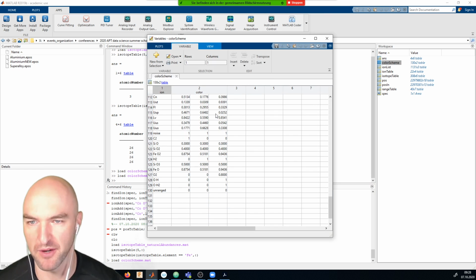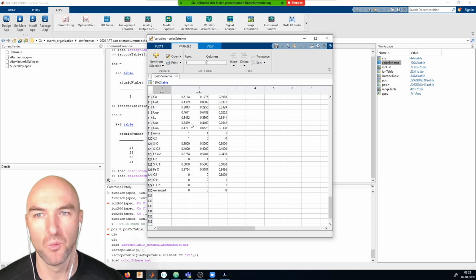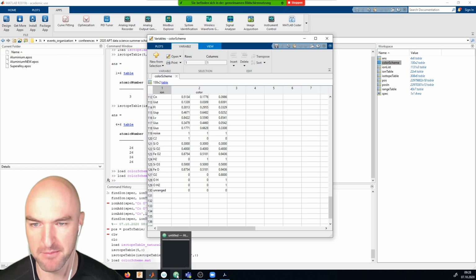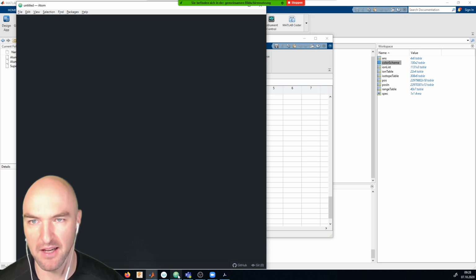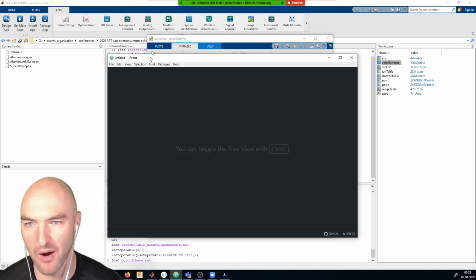And in the color scheme, if I go into the color scheme, you can see here that we just have names for the ions and the colors that are associated with them. And you can also have complex ions. And here, it's actually very important for us that we have the ability to use names for our ions, and for that I will just quickly explain to you how our ion naming works.